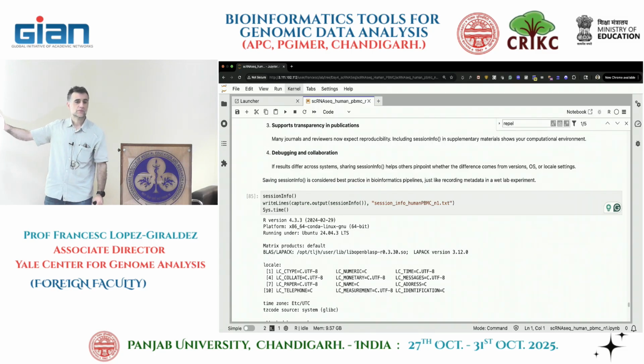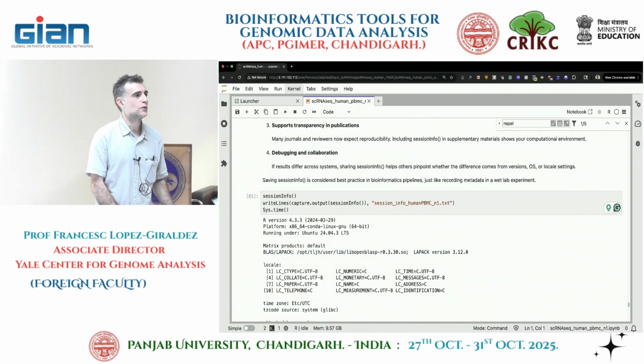So for a sample like this, there's not much left to do, right? We classify the genes. We could do a comparison between T cells if we want to. Will we do the myeloma exercise also? We could. It depends on what we want to do next. Some parts we can do the myeloma exercise. We can try, yeah. So before I move on, any questions about this notebook? One thing I can do is try to go fast through the next one in case.